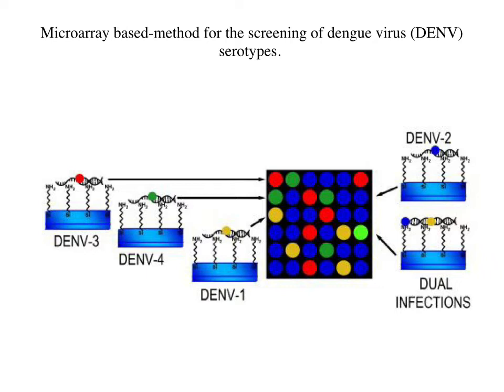So this particular microarray can detect all 4 of those. Other methodologies may underestimate samples containing more than 1 serotype. This technology can be used to discriminate between the 4 serotypes. Single-stranded DNA targets were covalently attached to glass slides and hybridized with specific labeled probes.